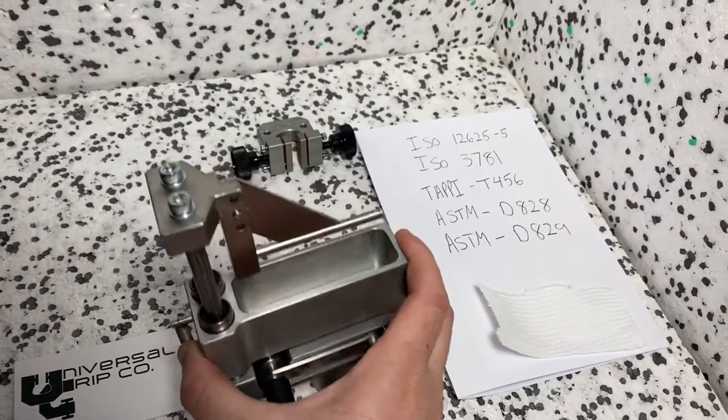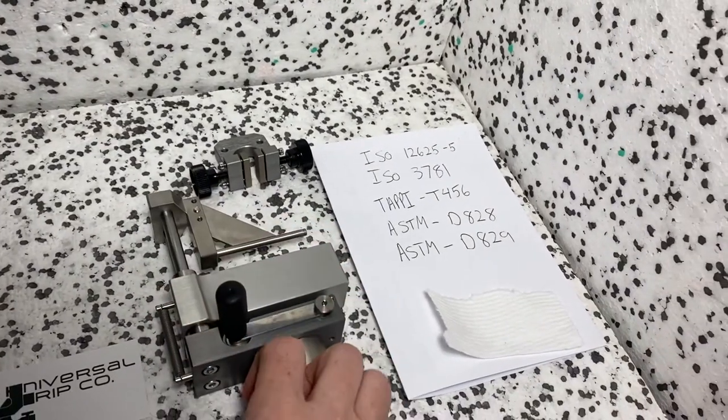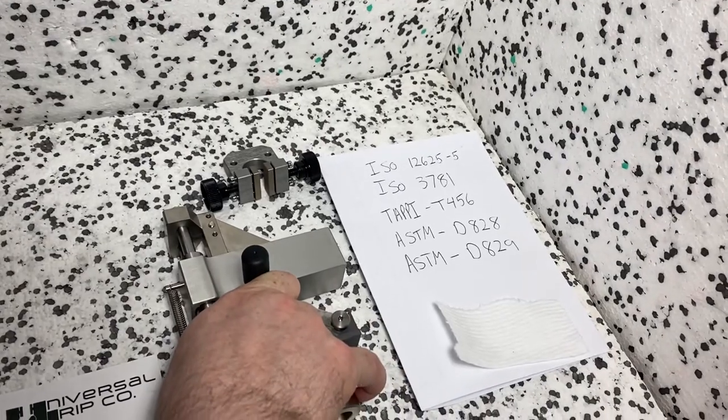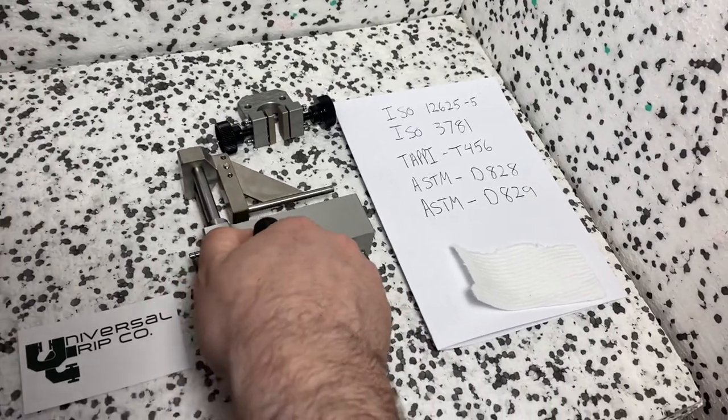You would fill this little basin up with some water and then there's a handle and a spring here which moves it up and basically will wet your sample.